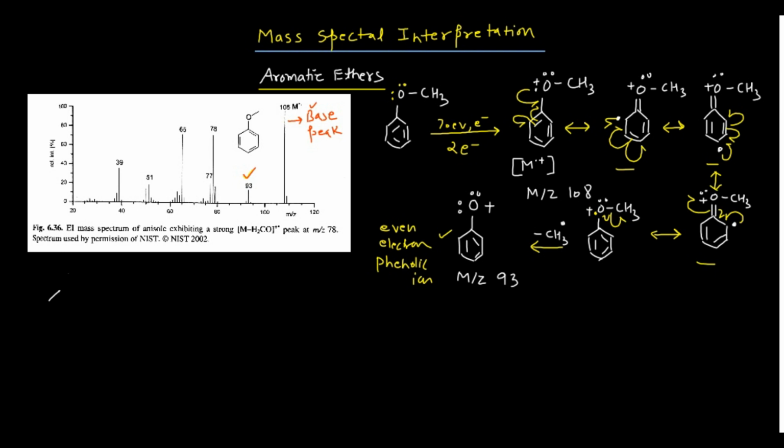Say this is the benzene ring, and this is having this structure, and you are having oxygen with 2 electrons and 1 odd and 1 positive, and your CH3 group. So I am writing this CH3 group as a CH2 and hydrogen because it will solve my purpose and it will give you a better explanation.